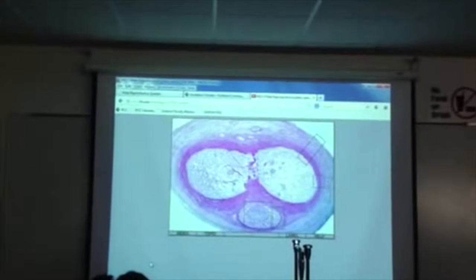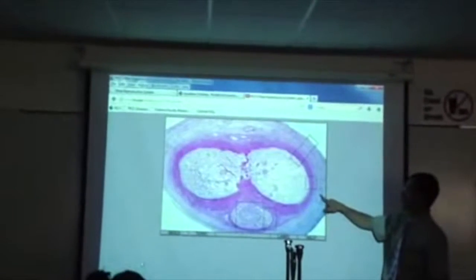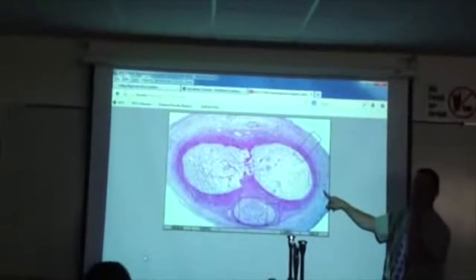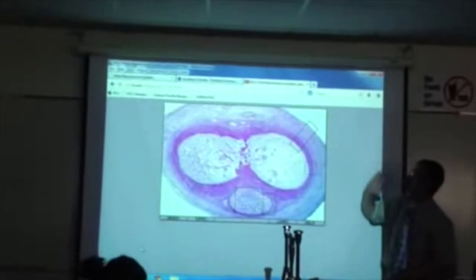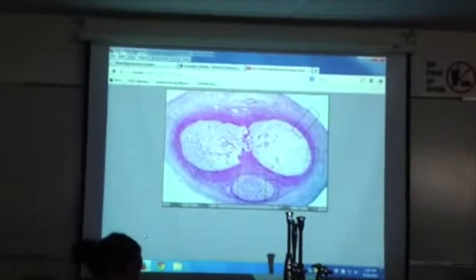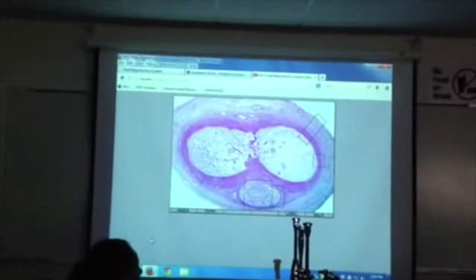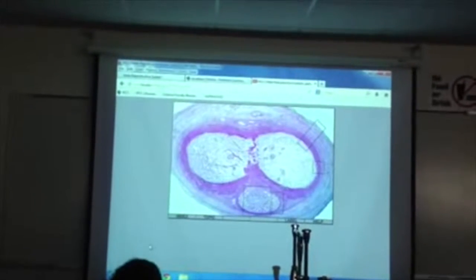What tissue? Basically, this is called the superficial fascia, which is another wrapper, and then this is basically dense. Is it irregular? I want to say irregular. No, irregular. It's dense something. Don't tell me which one. And then skin. So it's basically just skin on top of a fascia on top of a bunch of blood. Why aren't there any deep arteries in the spongiosum? Because you have the urethra there instead. So you use smaller arteries. There are not the big ones.